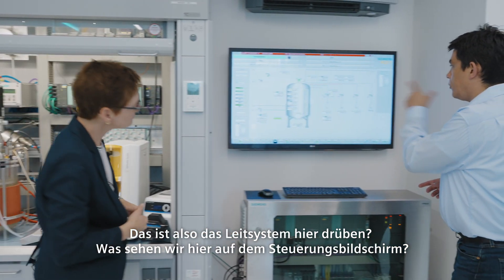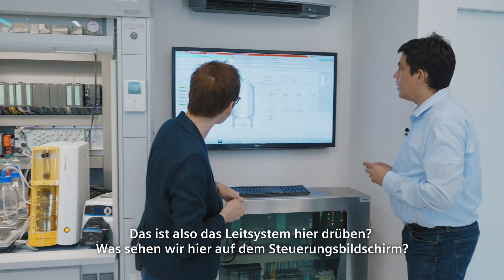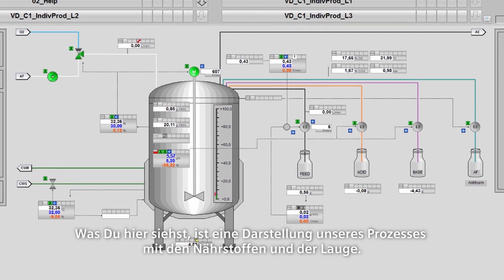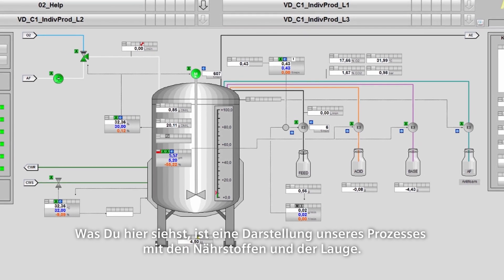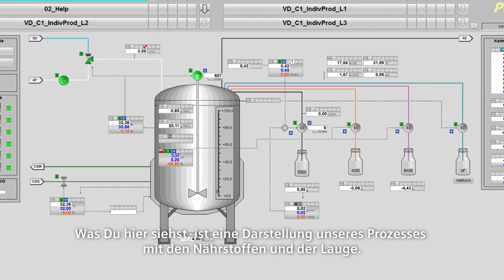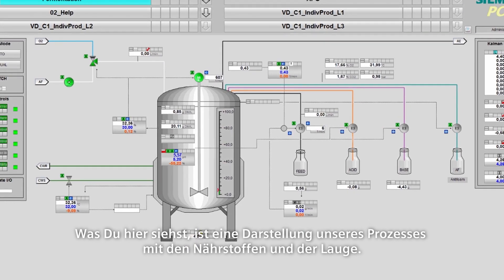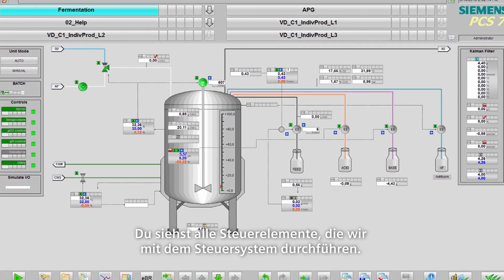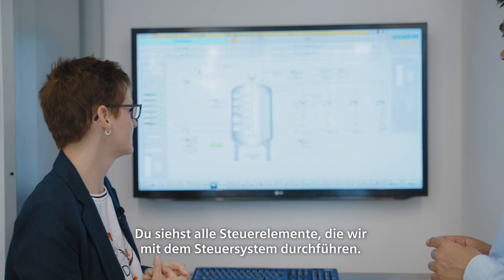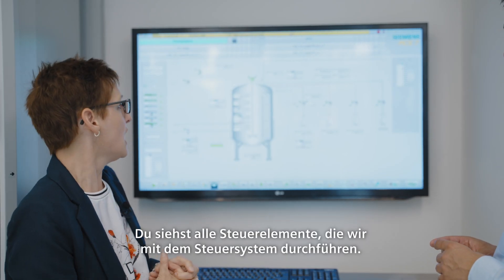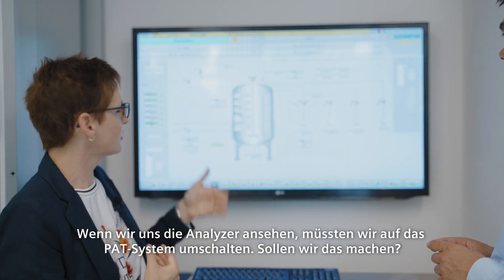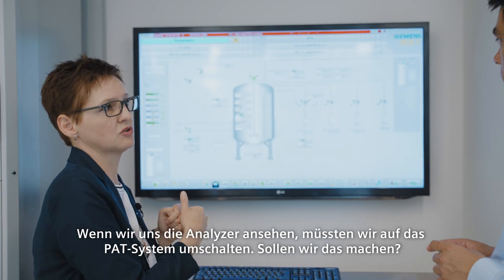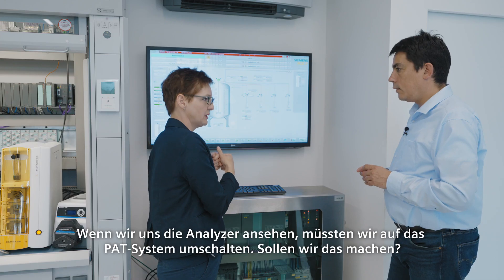What you see here is a depiction of our process with the feed and base. You see all the control elements we are actually working with in the control system. To look at the analyzer, we would have to switch now to the PAT system.